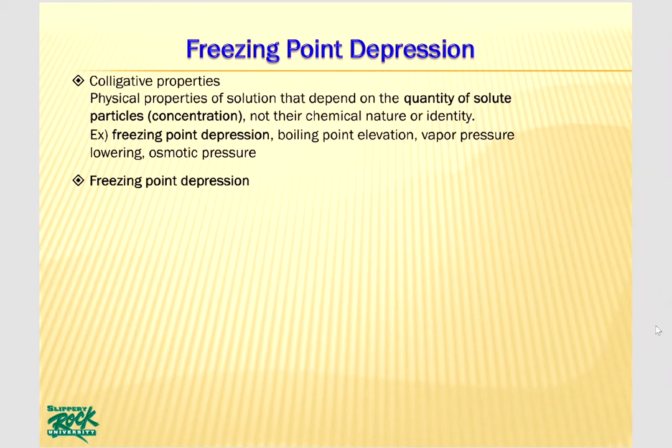What is the freezing point depression? Pure water freezes at 0 Celsius and 1 atm, but the salt water freezes at lower temperature. It is called freezing point depression.